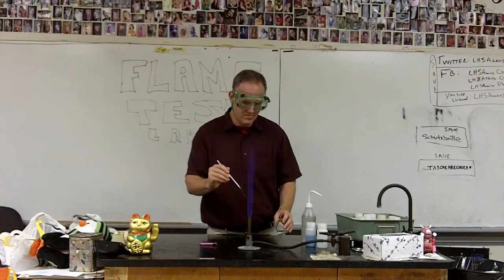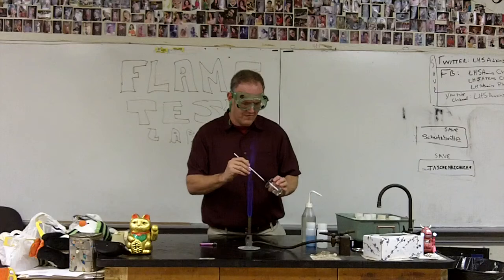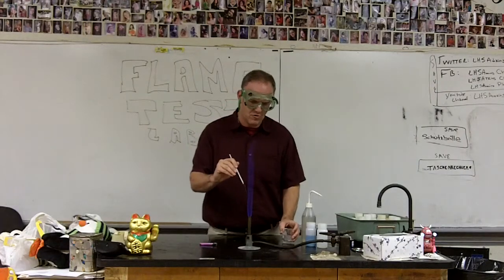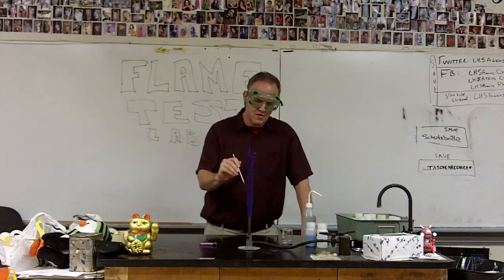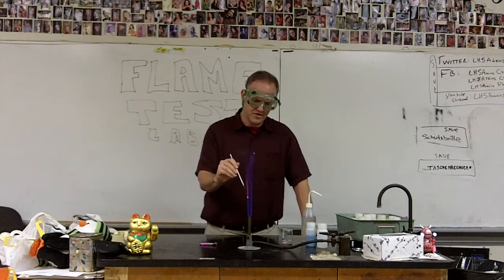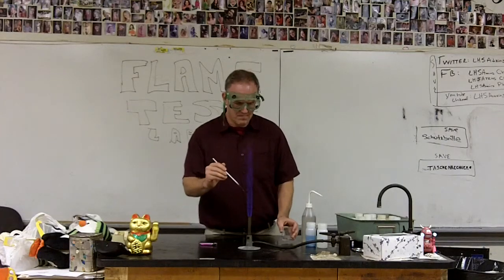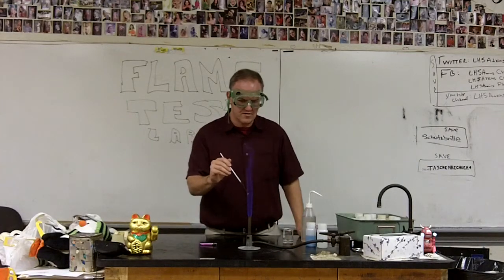It's rinse, burn, repeat. We may not get all of the color out. What we want — what we'll feel good about — is if all we're getting is an orange flame, because the nichrome wire by itself with nothing else on it will give us kind of an orange flame, kind of like what you're seeing right there. I'm going to turn off the lights when I do this, so you might be able to see things a little better.